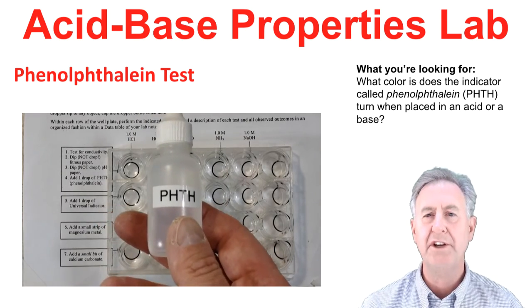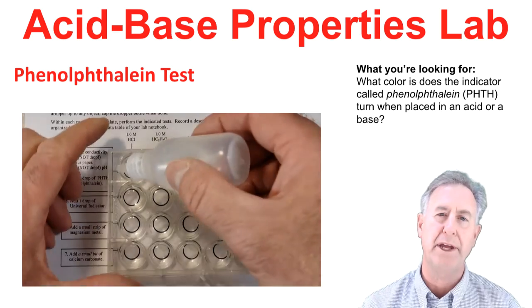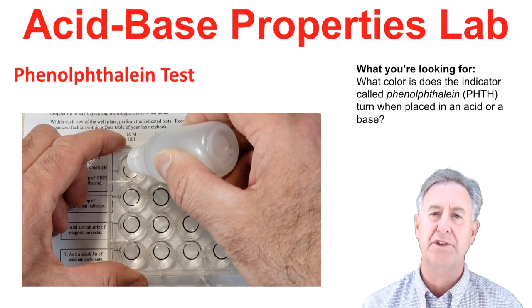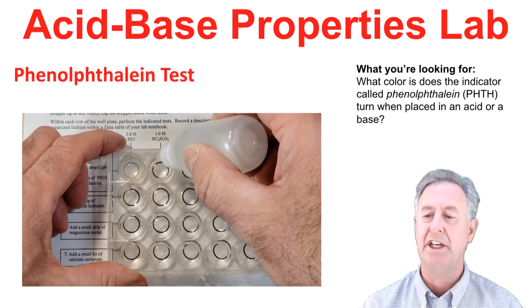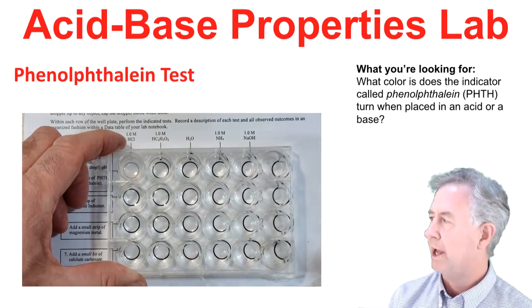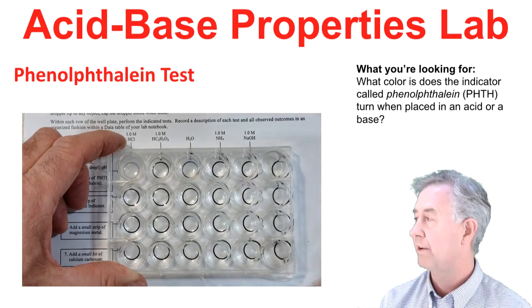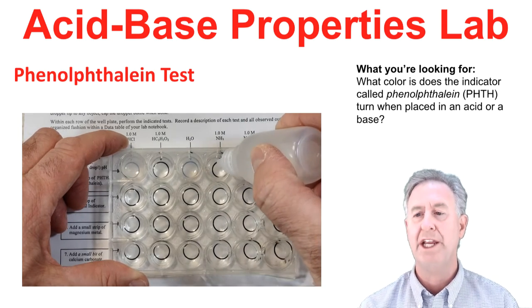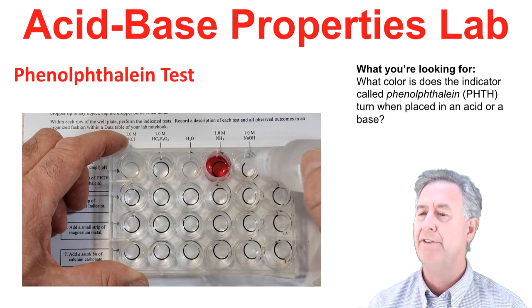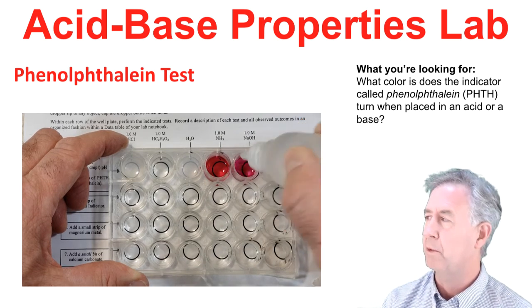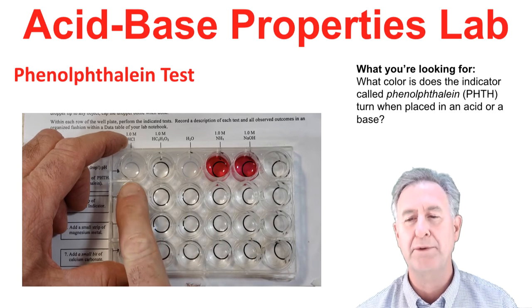Phenolphthalein is an indicator that turns a different color in the presence of an acid compared to a base, demonstrating whether the solution is acidic or basic. We put a couple of drops of phenolphthalein in each of our wells. The two acid wells are colorless, water is colorless, but in NH3, a weak base, it turns pink. And finally, NaOH, a strong base, turns pink again.